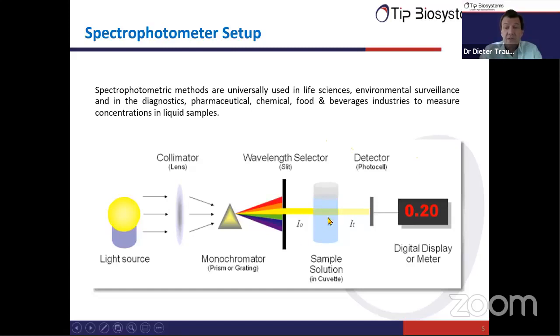So here we have the sample, and then the light is transmitting through the sample and reaches the detector. And the detector simply measures the light intensity that arrives at the detector. So now we have a sample here, and typically this is liquid samples. In this case, the sample could contain, let's say, water, but water does not absorb white light. So this would mean all the light would actually transmit through the sample and reach the detector.